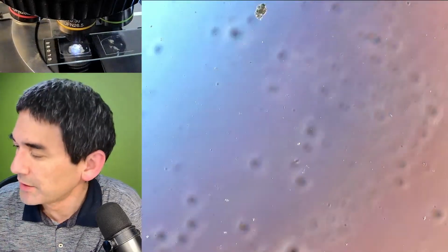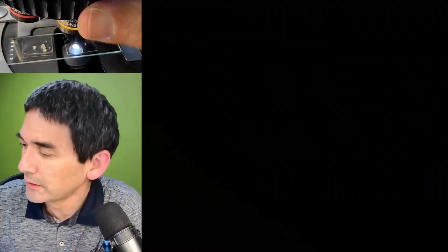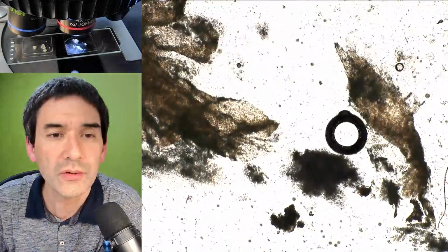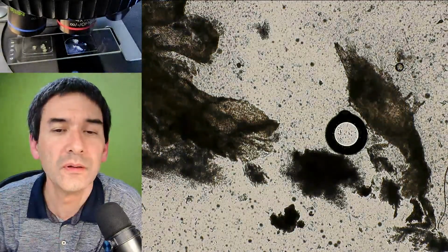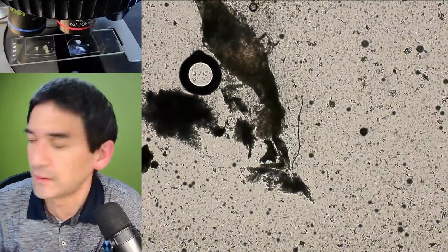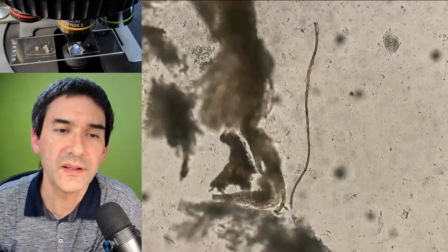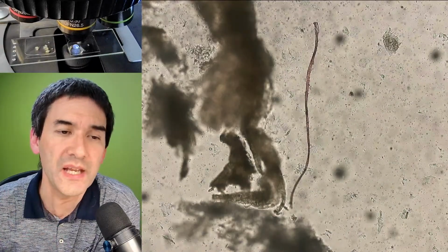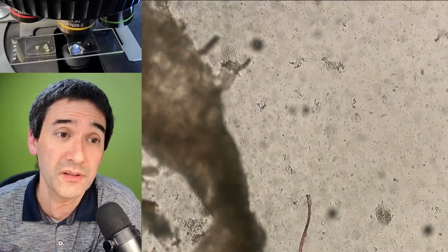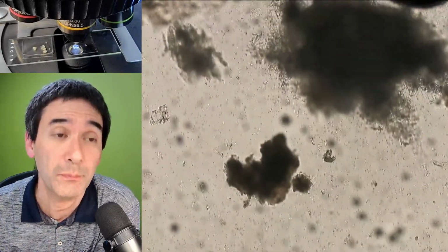But let me see, maybe the other sample is a little bit thinner over here. Let me go down a little bit with the magnification. Let's also remove the polarization here. For example, those things here. You find a lot of these fiber-like structures, and some, I'm not saying all of them, but some of them could actually be synthetic. And I'm wondering, how does this stuff find its way in there? A couple of months ago, I've also seen stained ones, like blue ones, for example.